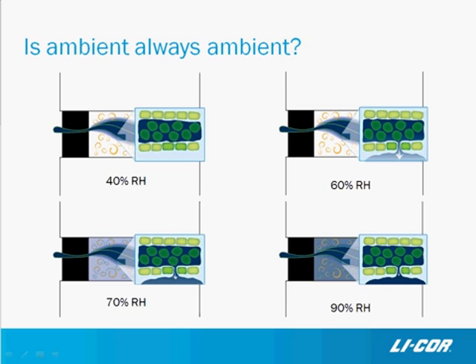The one exception to our ambient rule is water. Normally, plants have a boundary layer around them, so that even if the outside air is 30% relative humidity, the boundary layer near the stomates and the leaf is closer to 100% relative humidity. The LI-6400 mixing fan removes part of this boundary layer, so we have to add the humidity back again. If we don't, the stomates will close and we won't see any gas exchange.